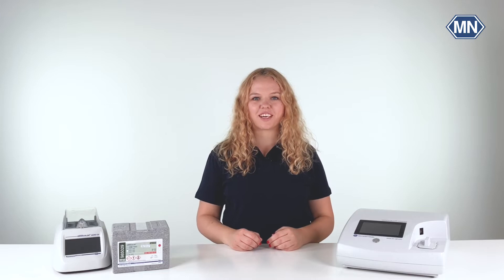Hi, my name is Anne. Welcome to the YouTube channel of Macherey-Nagel. Today I want to show you how to perform the Nanocolor COD tube tests using the Nanocolor COD 1500 test kit.